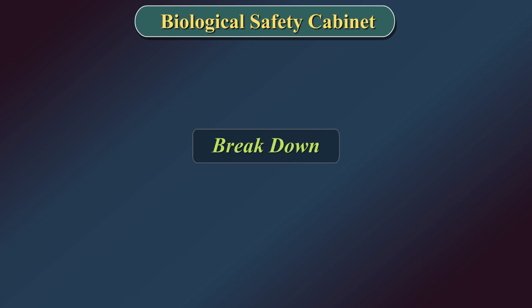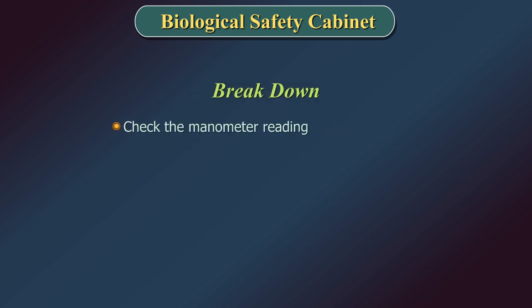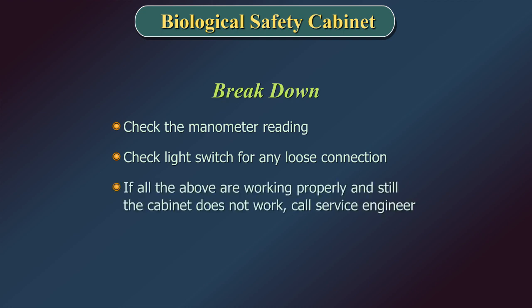Breakdown: In case of a breakdown, check the manometer reading and check the light switch for any loose connections. If all the above are working properly and the cabinet still does not work, call the service engineer.